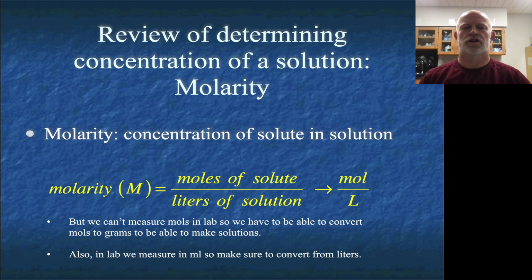Okay, in this video, we're going to talk about concentrations and how we create the right concentration solution. To do that, we first have to remember our math. To find the concentration of a solution, or to have the proper concentration of a solution, we usually want to solve using molarity. That's the most common way that concentration is done in chemistry.